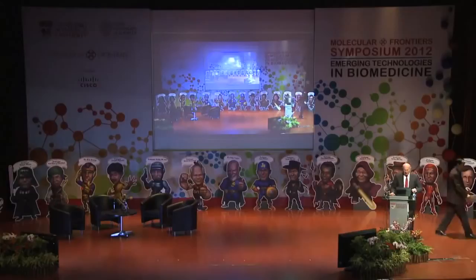Thank you very much for introducing me and for having me here at this wonderful meeting. I think we're all familiar with the expressions "a picture is worth a thousand words" and "seeing is believing." Therefore, I don't think it's a coincidence that the beginning of the natural sciences as we know them today very much coincides in time with the invention of the microscope, or of the light microscope, to be precise. Because with the light microscope, we could see for the first time that any living being consists of cells as their basic units of structure and function, and with the light microscope, we discovered, for example, bacteria and so on.